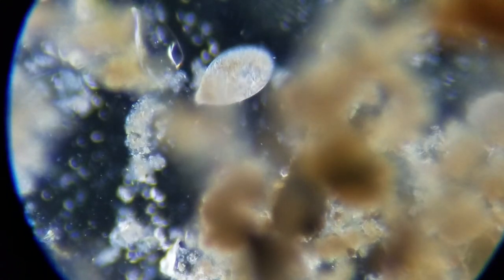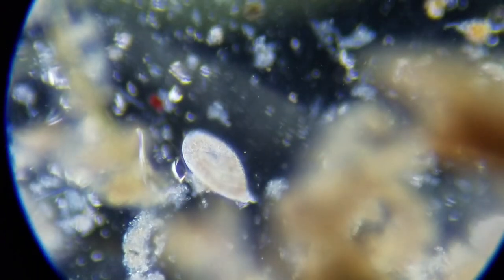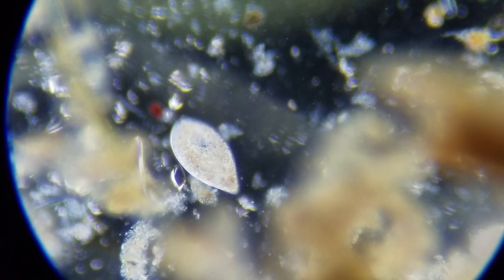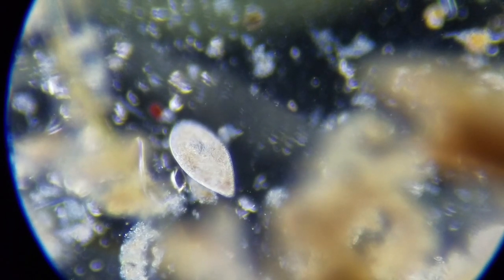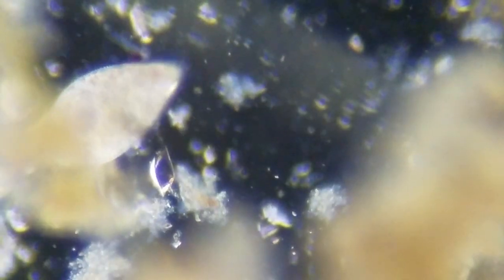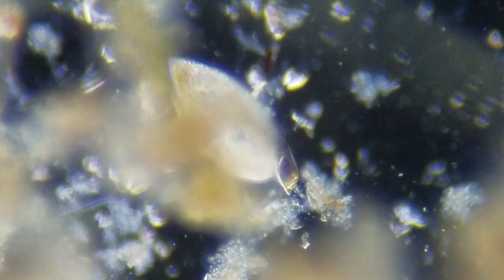We have something that looks like a ciliate here, and it's got the shape of a Frontonia, but I don't think that's what it is. It's just see-through. Enlarging a little bit, and we can see through him. And he's underneath some algae right here.